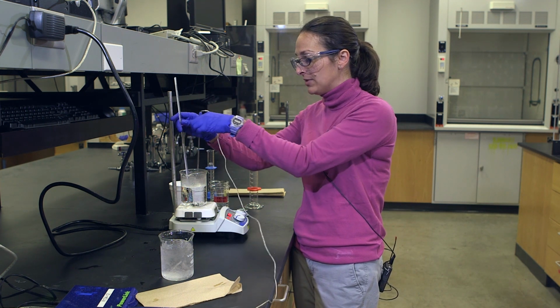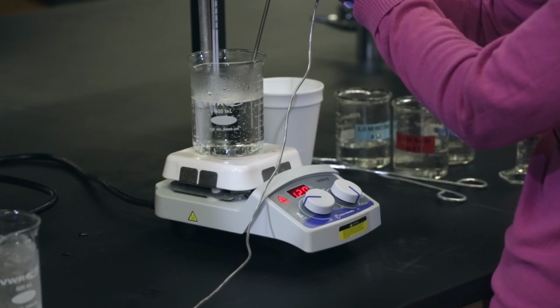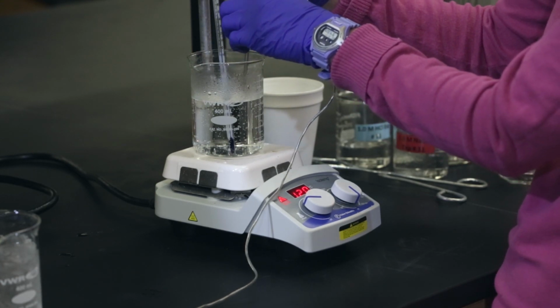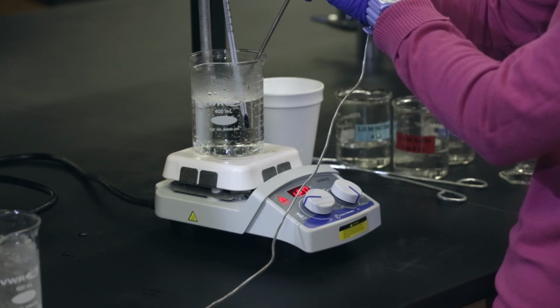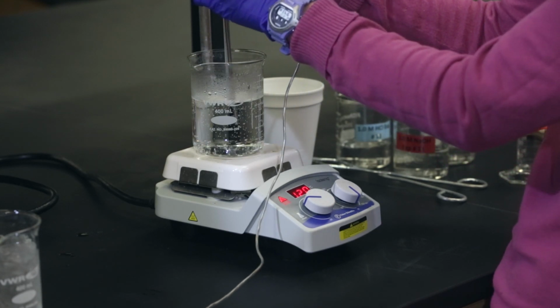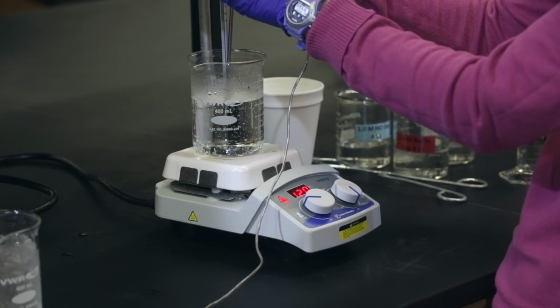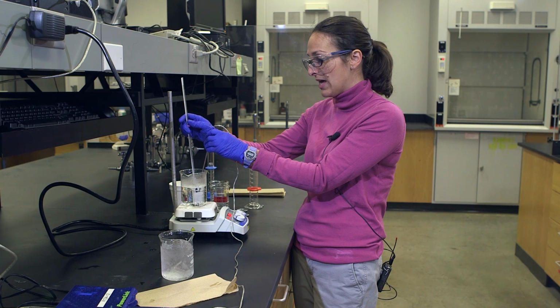So to set my upper temperature limit, what I'm going to do is put my thermometer and my temperature probe both in the water. I don't want to set it down on the bottom of the beaker because that's really measuring a much higher temperature next to that really hot plate surface. And I don't want to touch the side of the beaker with either my thermometer or my temperature probe. I want to hold it somewhere in the solution far enough away that I'm not touching the sides or the bottom of the beaker.